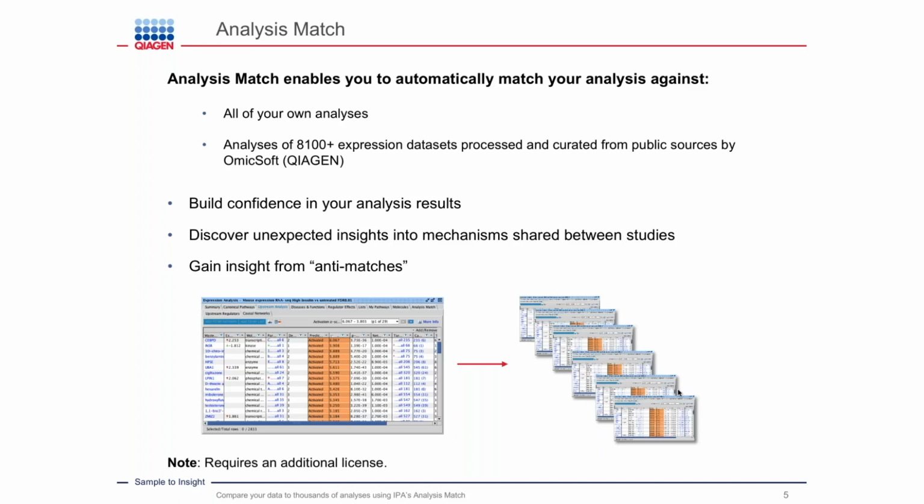I just want to make a really quick note here that the analysis match feature does require an additional license on top of IPA's Advanced Analytics license.